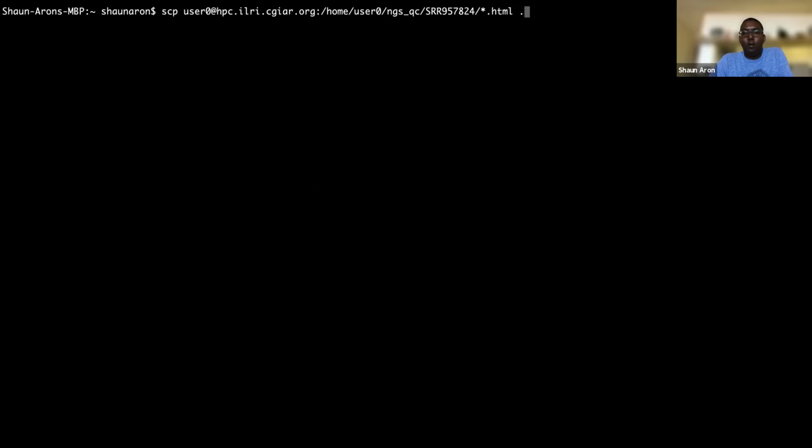So Emmanuel, it's a bit difficult to help you. What is the problem? You got the files unzipped. Have you managed to load fastqc? You can unmute and just let me know where you're stuck. Emmanuel, you can unmute and let me know where you're stuck.